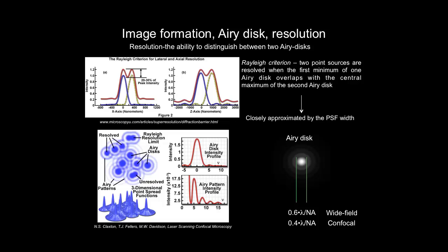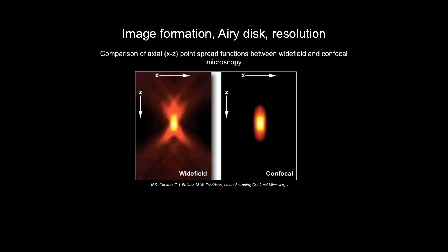And if we look at the difference in axial resolution between the wide field and the confocal, we notice the dramatic reduction in the intensity of the wings for the confocal.